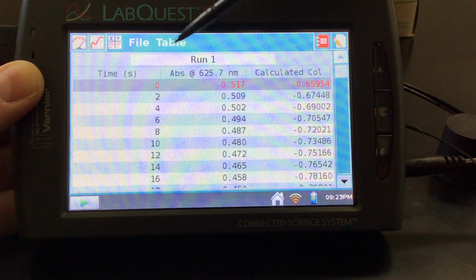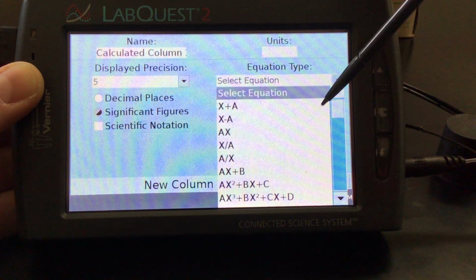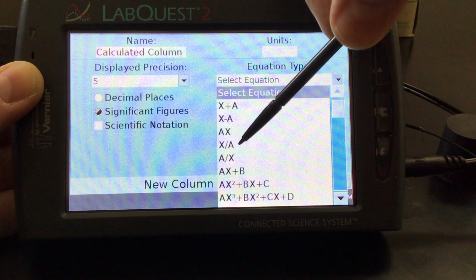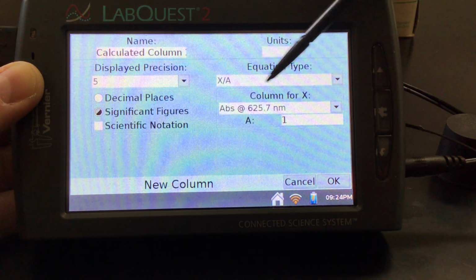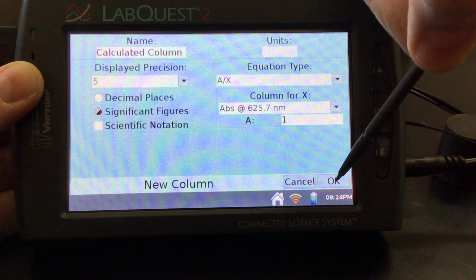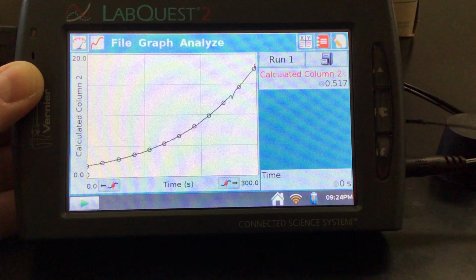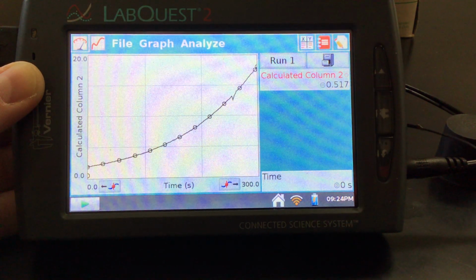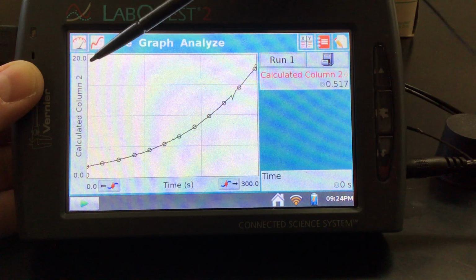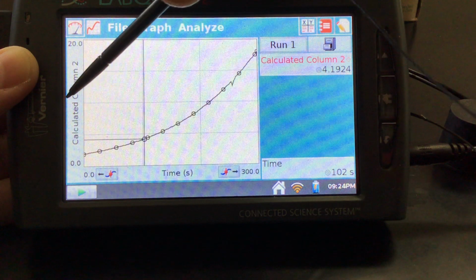Just to double check whether or not this is second order, sometimes it's not as clear as we would like, we could create a new calculated column, and then select a different equation. It's a little bit clunky how they do the x and the a here, but it's going to be a over x. Oops, I clicked the wrong one. It's going to be a over x. And we can see this is an upward trend, but it's not linear. So that really tells me that our first value, natural log of absorbance versus time, is going to be our linear relationship.